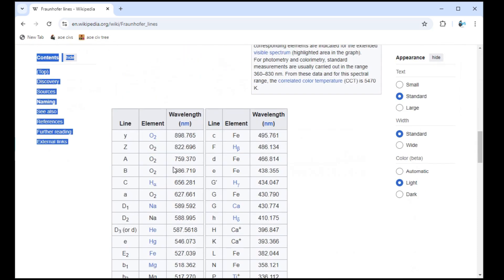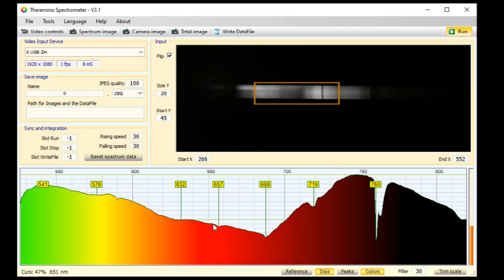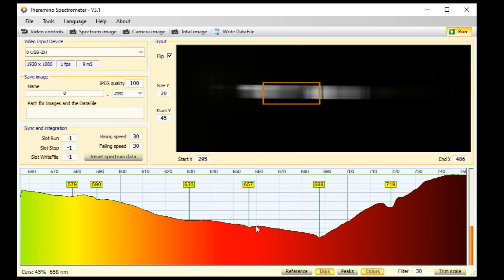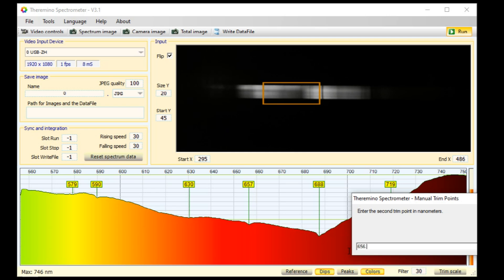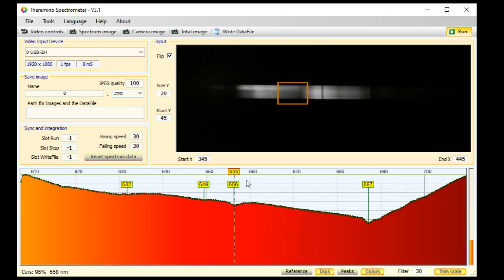The hydrogen alpha line is at 656.281 nanometers. So I zoom in on that area and drag the spectrum a bit to center the hydrogen alpha line. It seems out of calibration by a nanometer, so I go back to manual trim points and set the second one to 656.3, dragging the trim point until they both say 656. Note that you can only have two active trim points, which is good enough for me, but there is other software that will do more.